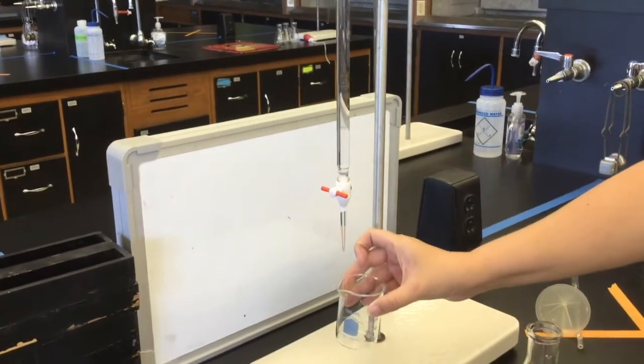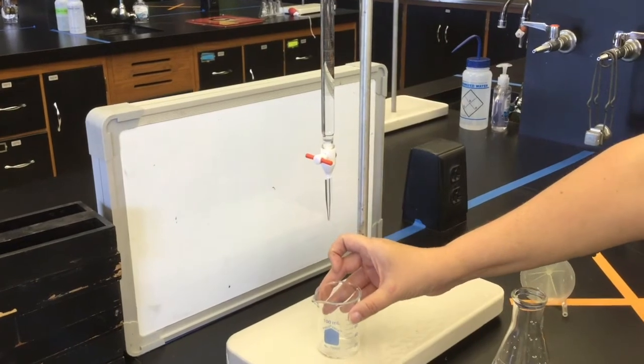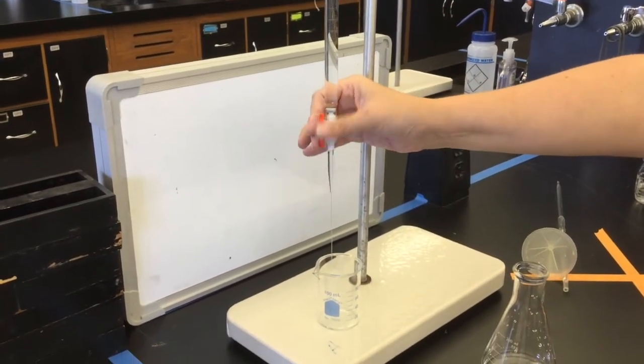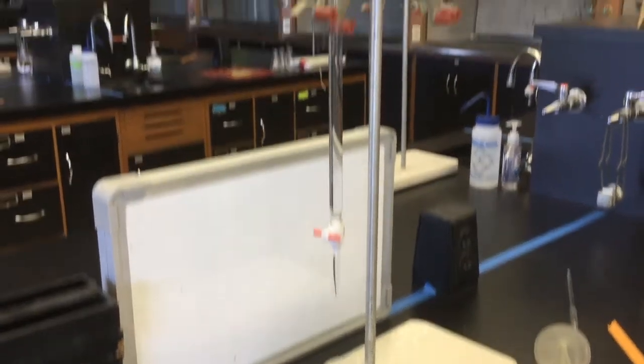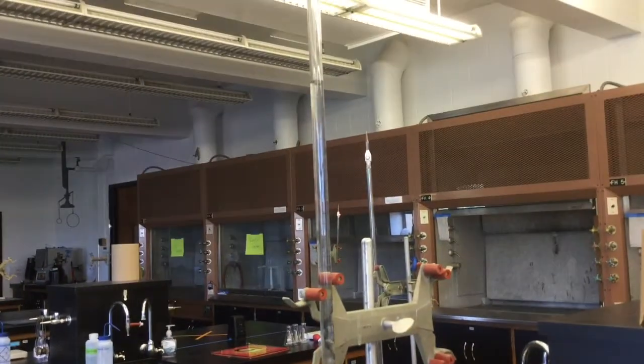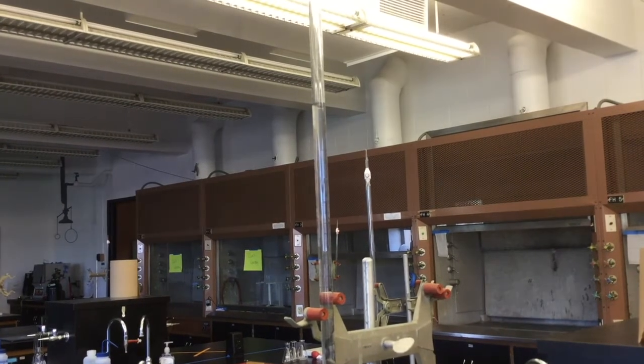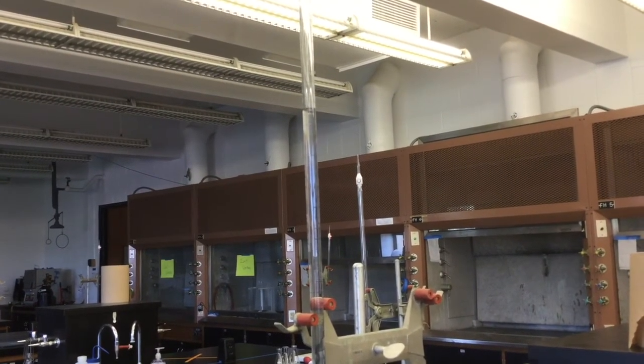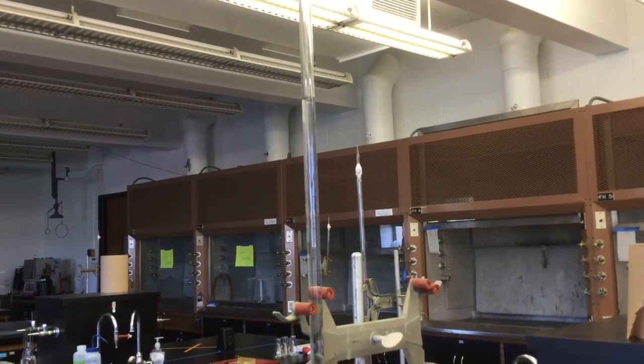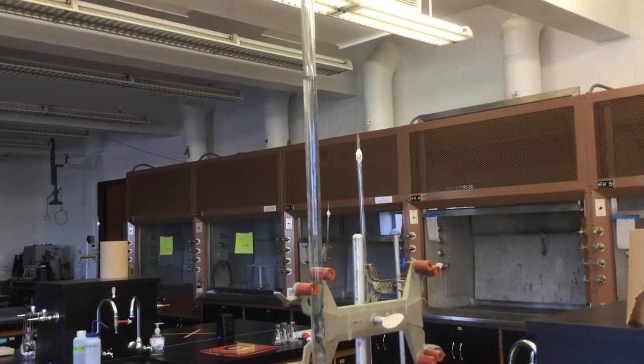Take one of the small beakers from your drawer, place it underneath the burette, and then open the valve for just a second to make sure all the bubbles come out. Check again to make sure that you're still above the 10 milliliter mark before you proceed. You only need to use a little bit of this sodium hydroxide in order to clear out the bubble. Make sure you don't do this into your flask.